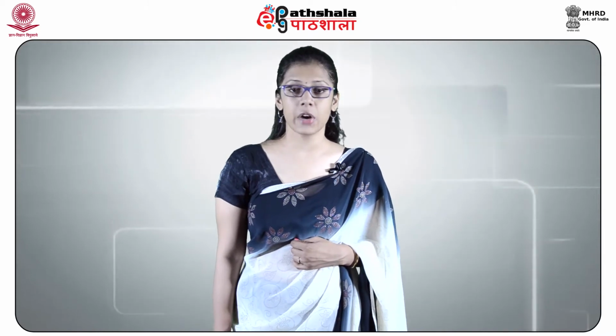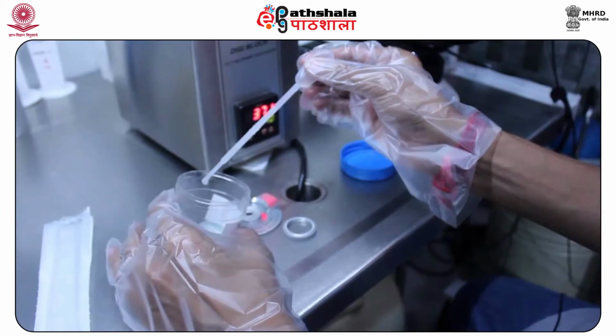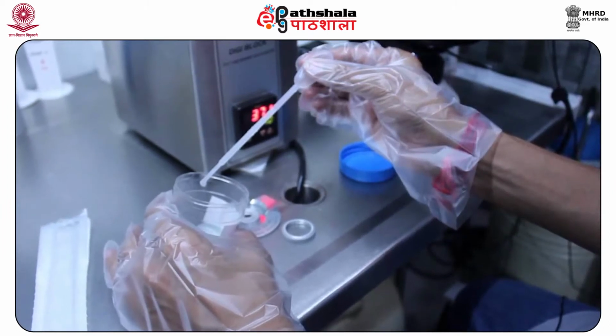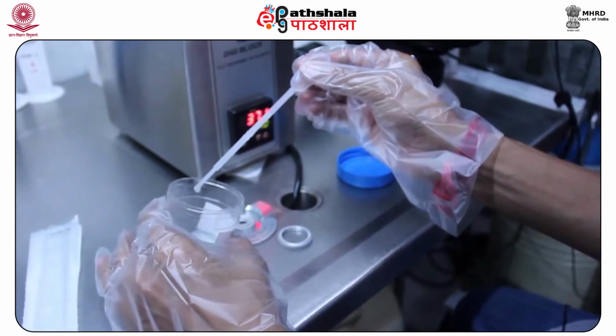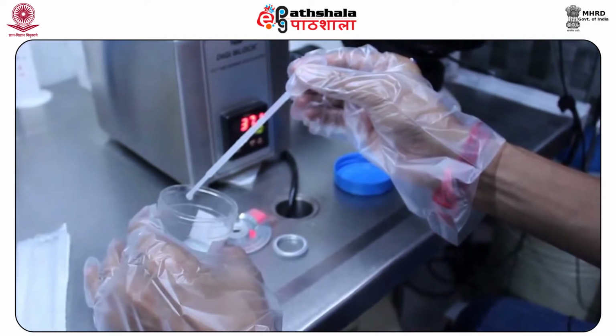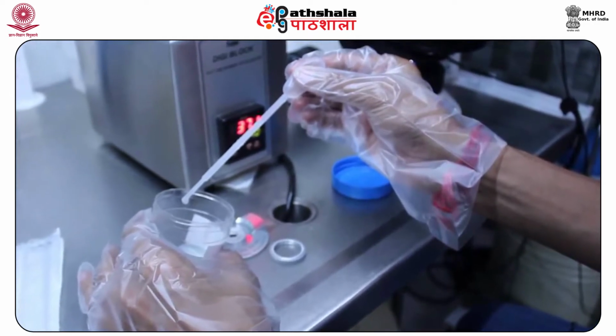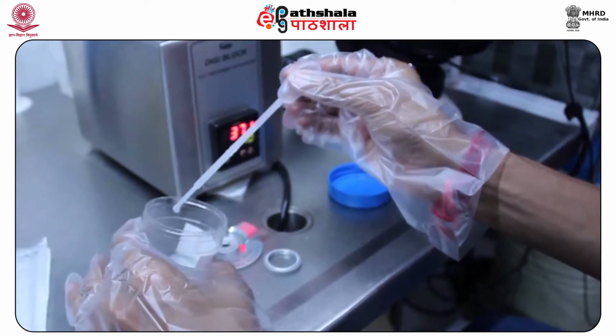Next we move to the presumptive test. First is the acid phosphatase test. The acid phosphatase test is one of the best known and most widely employed techniques for the purpose of identification of semen. The test is adopted because of the high acid phosphatase activity of semen.